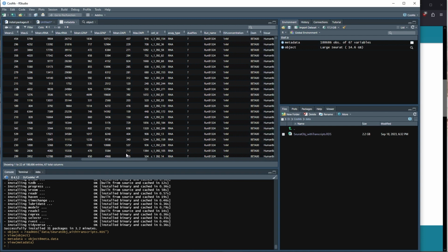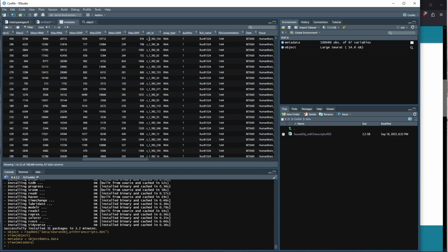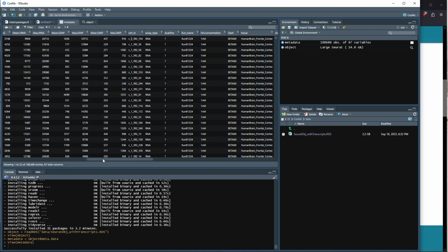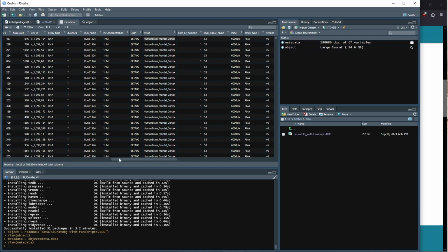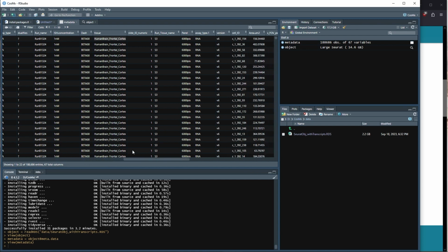Come back over here, and then we should have something like a slide. So you can imagine, I think each one can have something like 20 samples on a slide. And it's a tissue microarray. We can see what they were sequencing here or imaging, since it's the spatial molecular imager, or imaging.